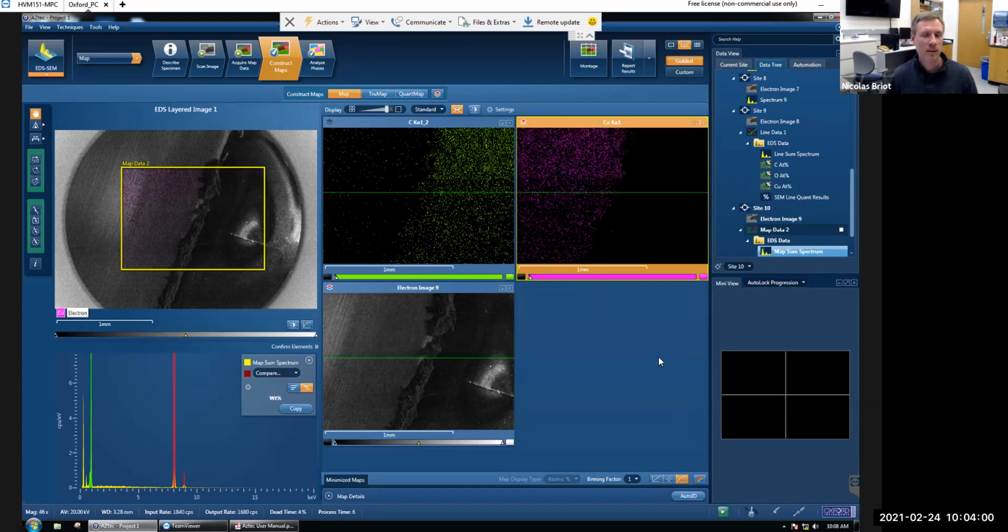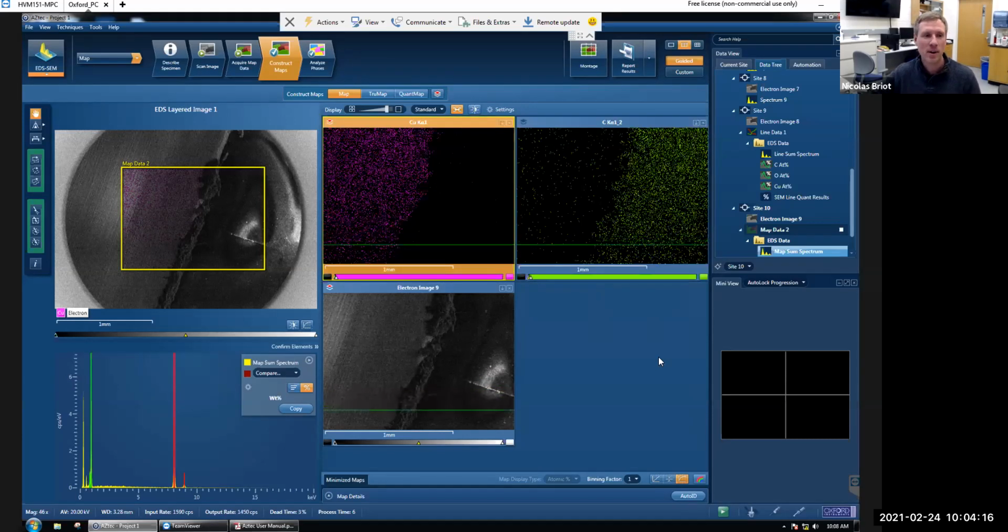But now it's so fast that you can have that as an overlay live. And that's what they mean when they say color SEM. It's an SEM outfitted with an EDS detector that's just constantly giving you feedback on the composition. That's very powerful because as you image, you can directly locate the region that you want to analyze. You don't have to pause, open another software, make a box, analyze, and all of this. It's just live all the time.